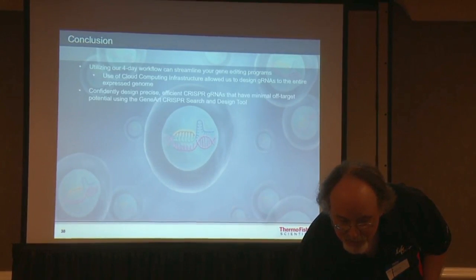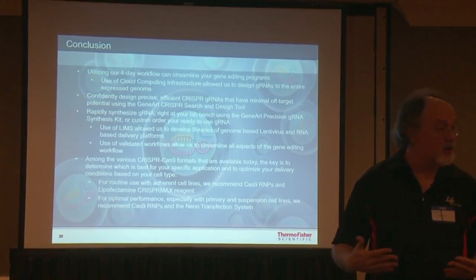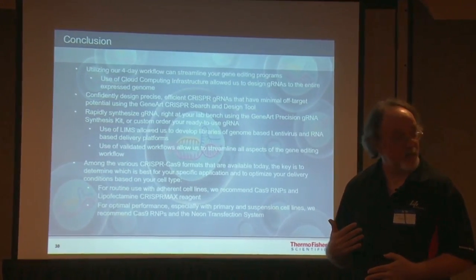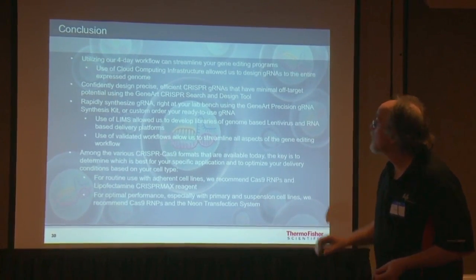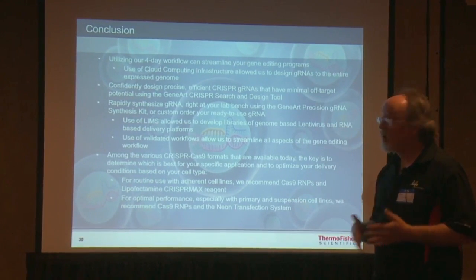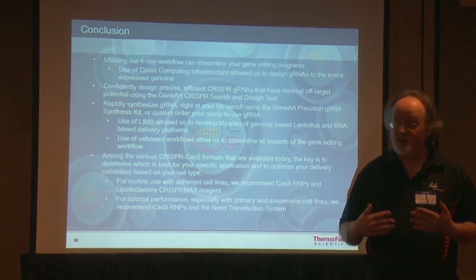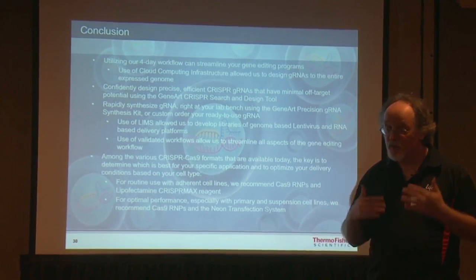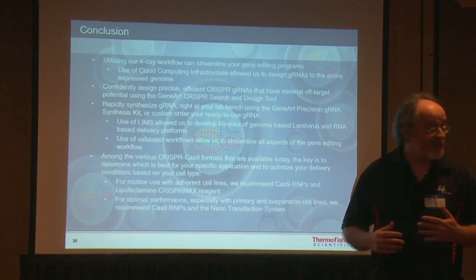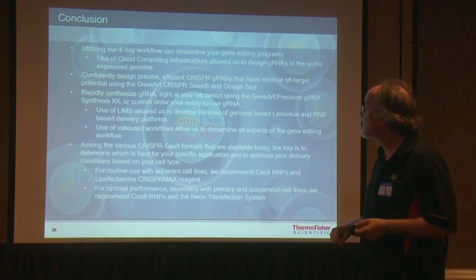So, conclusion really is there are an awful lot of benefits which have come to us through using synthetic biology practices and approaches, and also by using the way in which software has been developed to support synthetic biology over the last years. These benefits allowed us to streamline our gene editing program in order to maximize how we design good guide RNAs, and how we do the protocols. The protocol has to be standardized and has to work reproducibly. Ideally, there should be data around the cell lines that you're hitting with that particular protocol and how you should do that protocol for an individual cell line type.